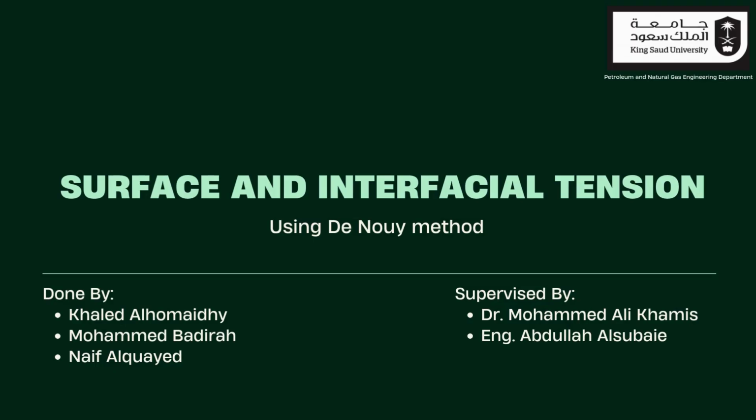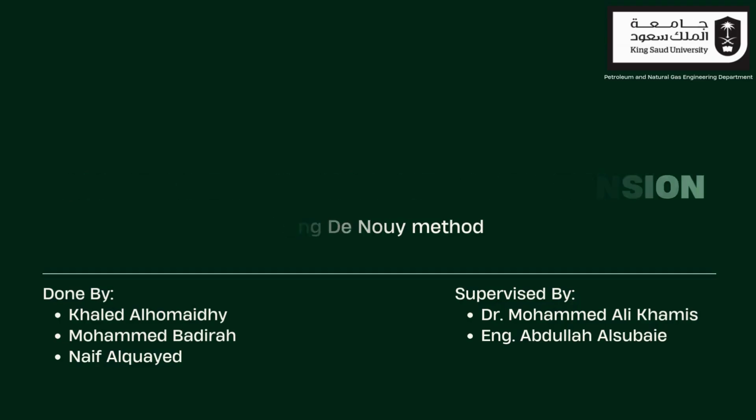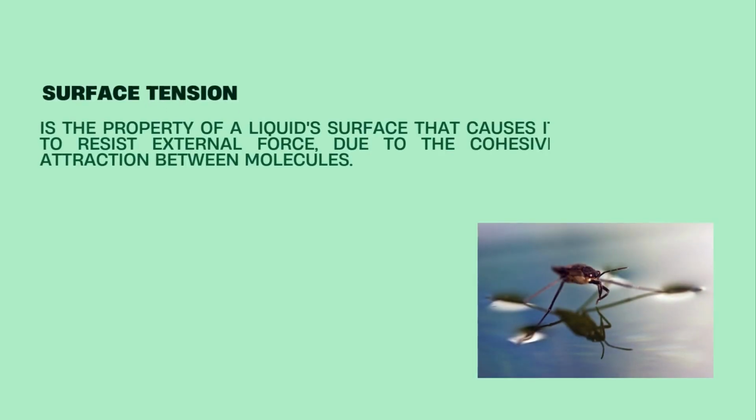We'll start by explaining the concept of surface and interfacial tension, their importance especially in the petroleum industry, and then guide you step by step through our experiment. Let's dive in. First we have to know what is surface and interfacial tension.